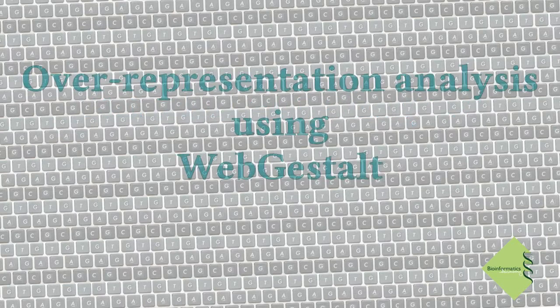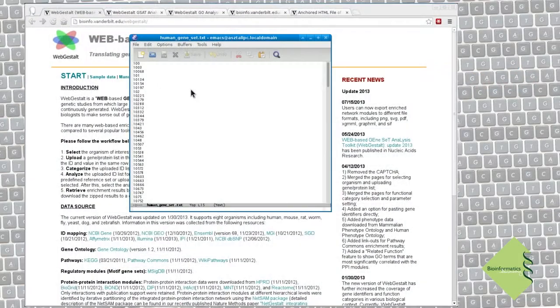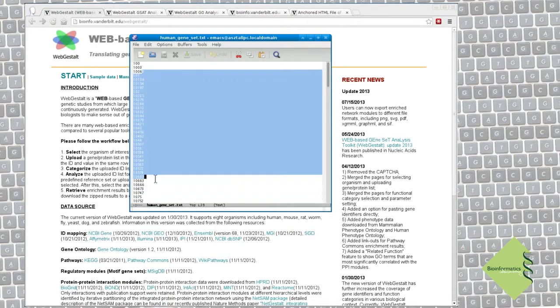Today, I will demonstrate how to perform a simple overrepresentation analysis using WebGestalt. We will use a list of human genes identified by Entrez gene IDs as a target list.